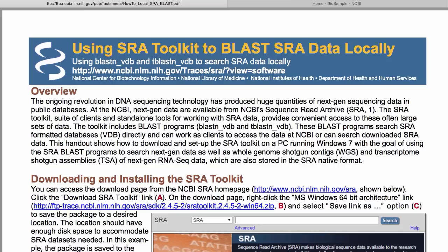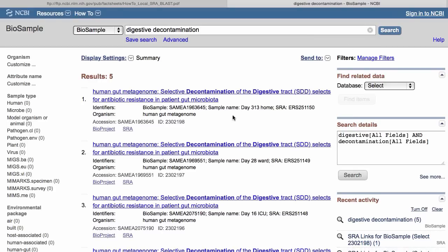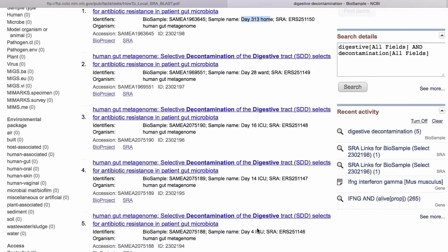This next search involves looking at some metagenomic data for the human gut, and I'm going to start with BioSample. I've entered 'digestive decontamination' as a query to BioSample. I see there are five samples from one person — all at different points in time. At the top I see 313 days at home, and at the bottom four days in ICU. In between are 14 days, 16 days, and 28 days.